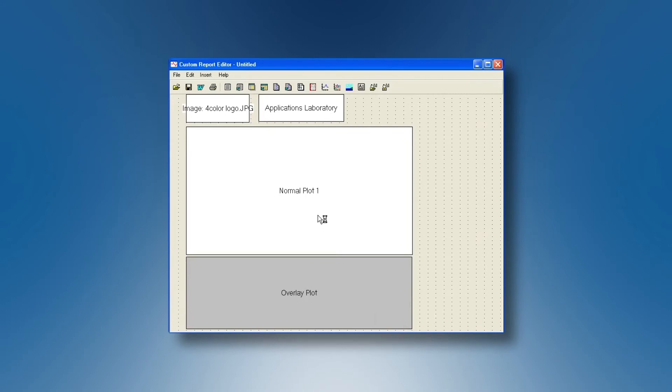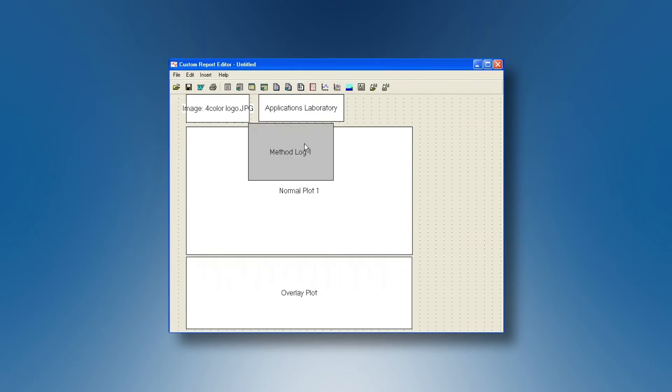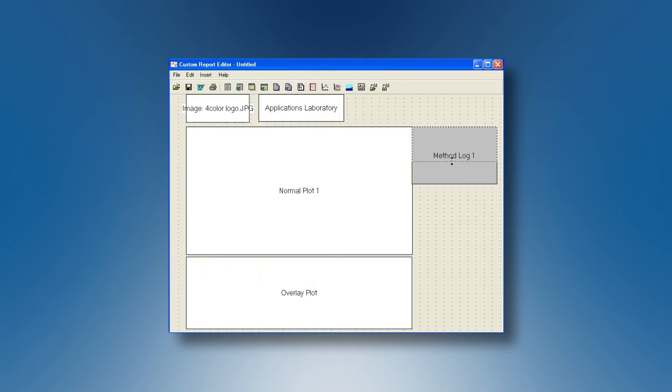You can decide for importing the method log, the thermal history of the data and you will put it on your page and give it the size you want also.